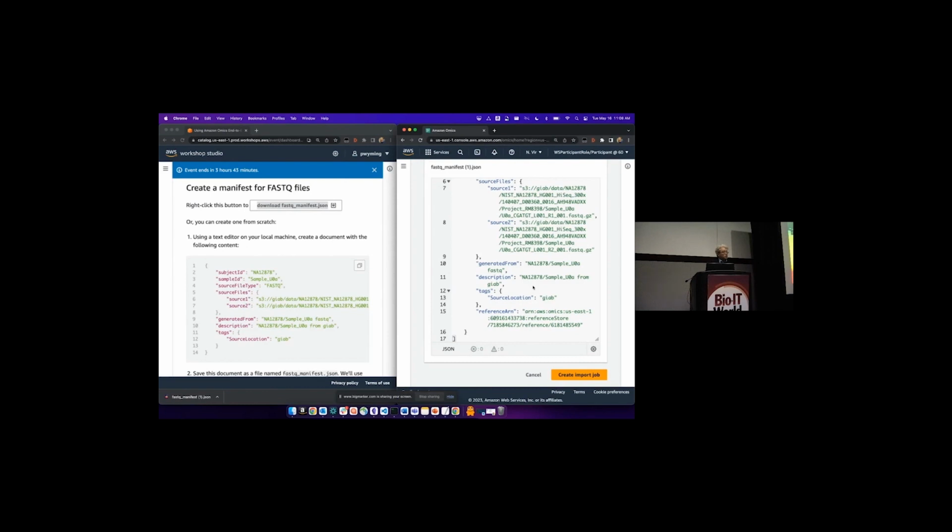I have a question. Sure. How does resolution of reference names happen? Say if you uploaded a BAM file where the chromosome names are different compared to what your reference genome is. So it was locked in, basically. You can do that. You might run into some issues. So Mark was going to comment there. So yeah, you can do it. Yeah, so it's not equal.